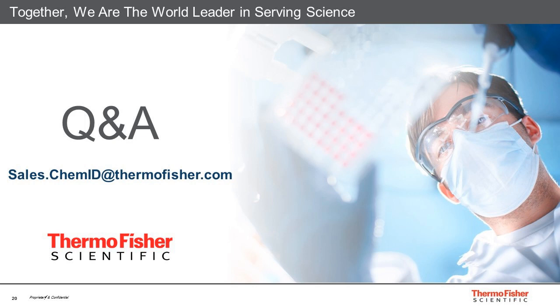Can you share your thoughts on using Raman to replace growth promotion as an ID test? I know we haven't directly studied that just yet. Like I said earlier, we're building out what we're doing within the biopharmaceutical space. Right now, we like to stick initially with the raw material part, making sure that the correct ingredients are being used where they need to be used. That's definitely another test that we could implement with the TrueScan. We just need to do some testing about it.